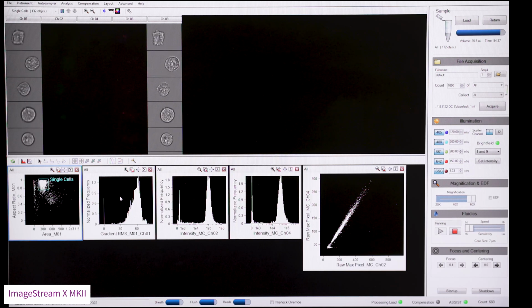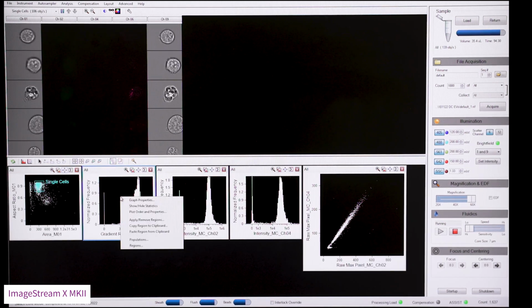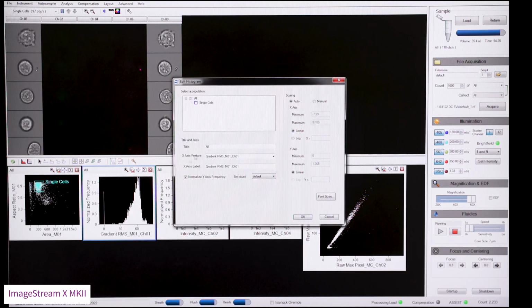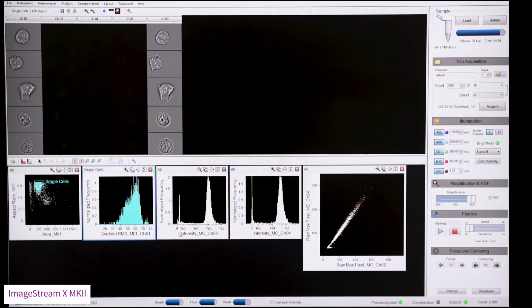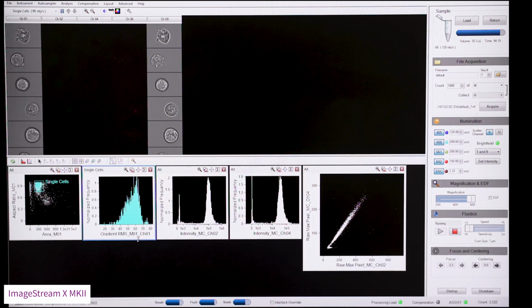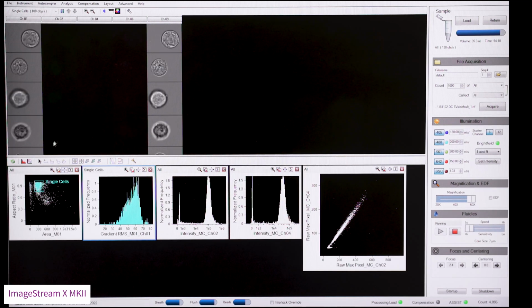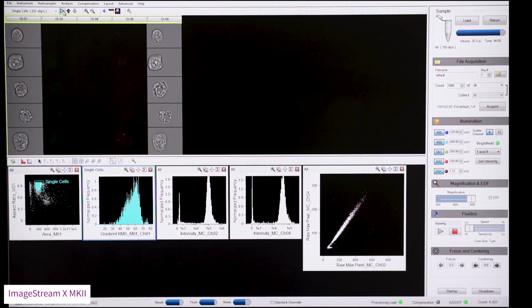First, apply the single cell region to the histogram displaying gradient RMS. Right-click on the plot and select Graph Properties, and at the top select Single Cells and press OK. The gradient RMS, or root mean square, assesses the variation in pixel intensities from the bright field image. In-focus bright field images have a lot of detail and have a high gradient RMS score, usually 50 and above on this particular machine. Out-of-focus events have little detail and often appear uniformly bright or uniformly dark.